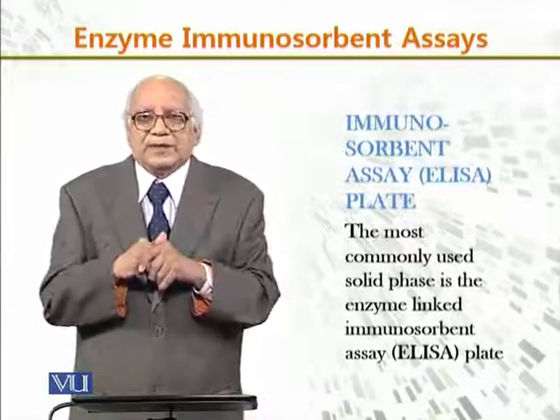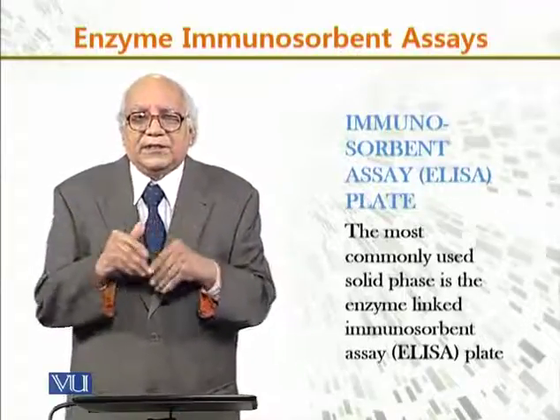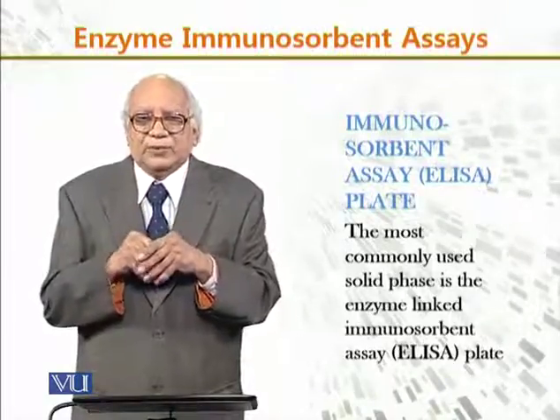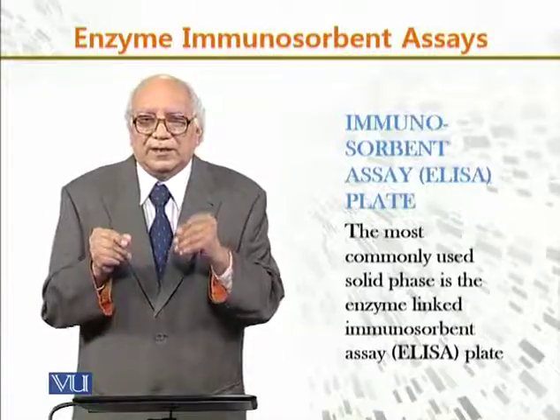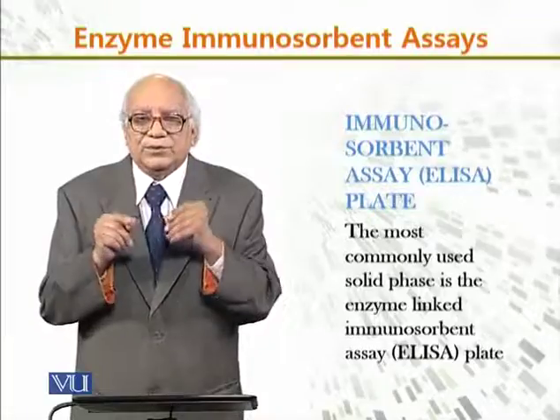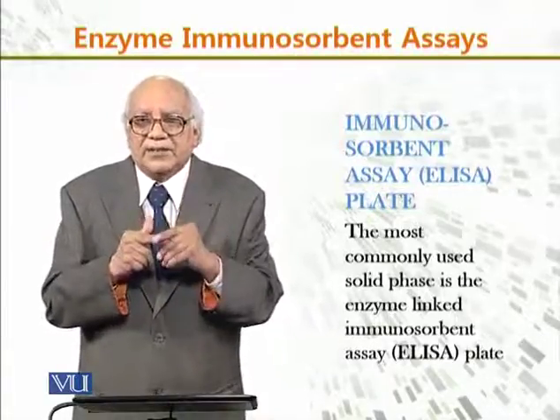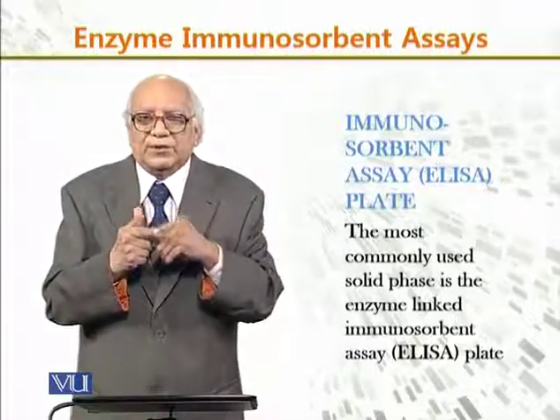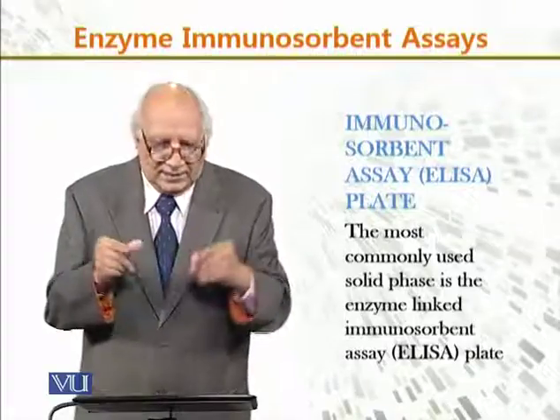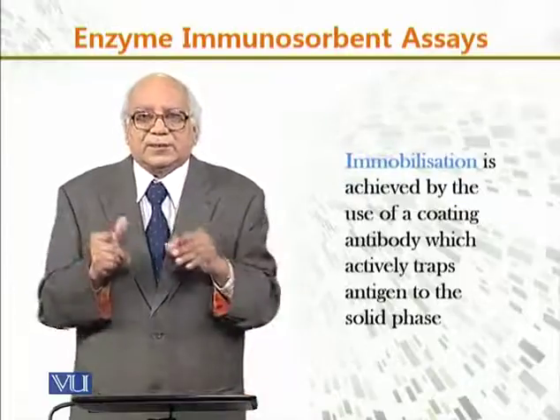Now, the immunosorbent assay is in brief called ELISA, and the most commonly used solid phase is the enzyme-linked immunosorbent assay. ELISA stands for enzyme-linked immunosorbent assay. And there are ELISA plates, which are the solid support.